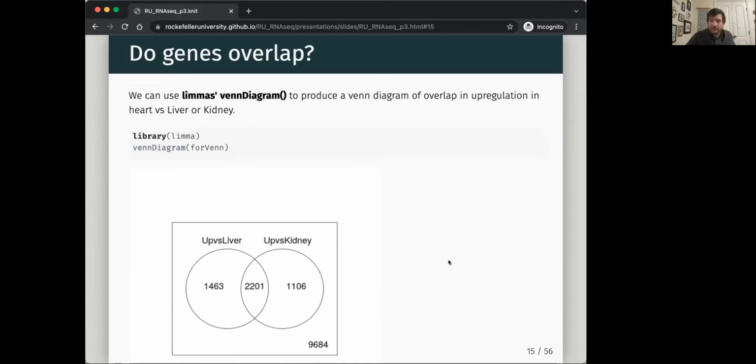So I'd say this is the most simplistic way of starting to understand these complex data sets, doing things like these overlap analyses. We often get asked to do them, but I would say they are the lowest hanging fruit. And there are some caveats associated with this. Sometimes what we see is that one group has some specific differences in variation. That makes doing this kind of analysis a lot more tricky.